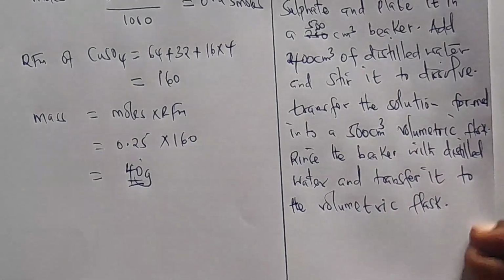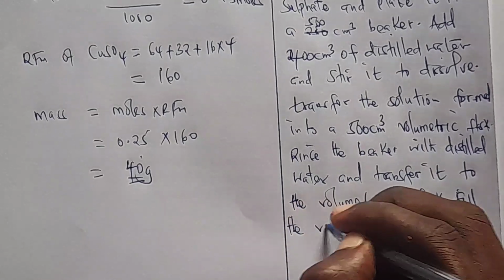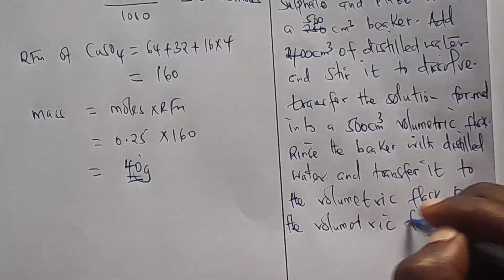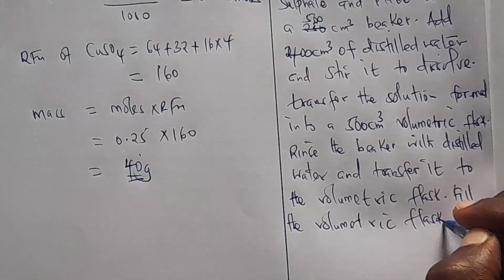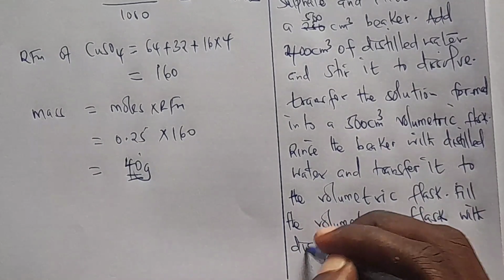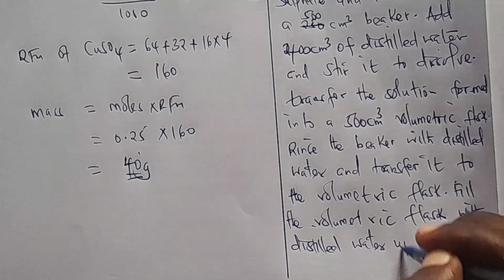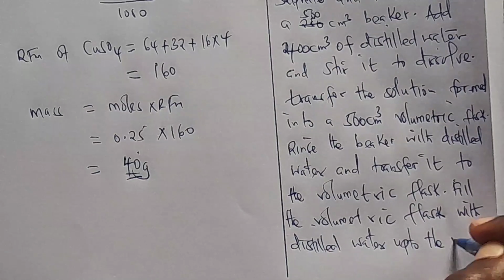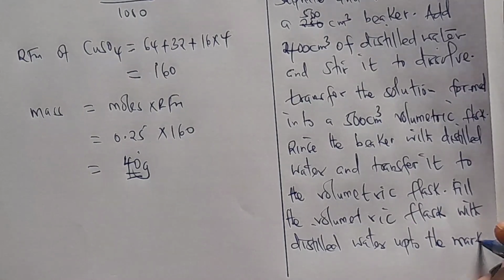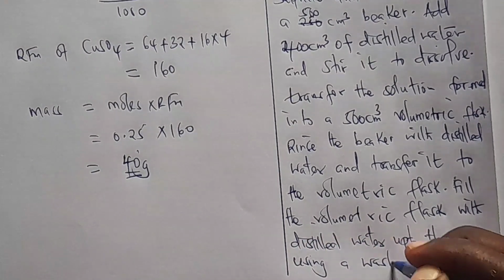Full stop. So you say fill the volumetric flask with distilled water up to the mark, full stop, or you say using a wash bottle.